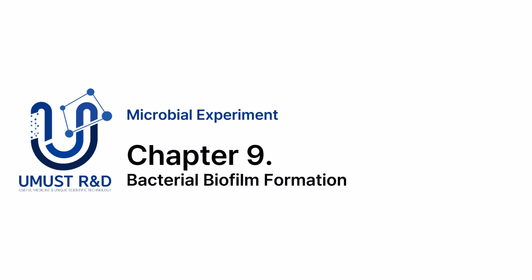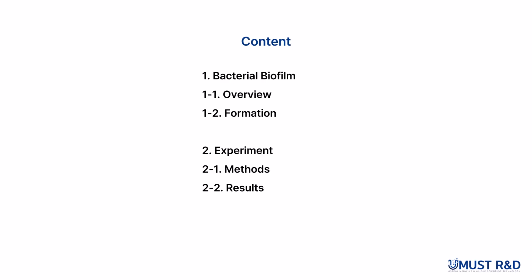We'll be covering bacterial biofilm formation, discussing what biofilms are, how they form, and how we can observe them during laboratory experiments. Here's what we'll cover in this chapter. First, we'll look into what bacterial biofilms are and the stages of their formation. Then, we'll move on to the experimental method used to study biofilms and analyze the results.